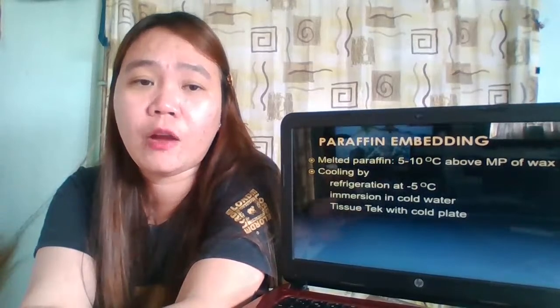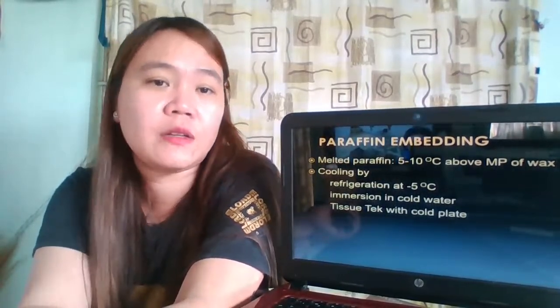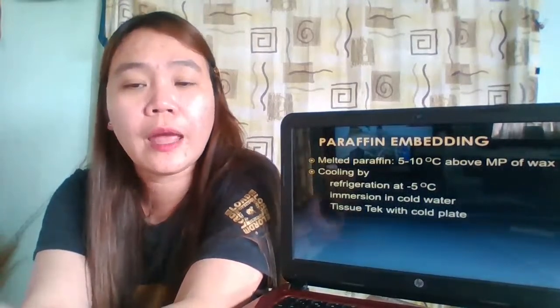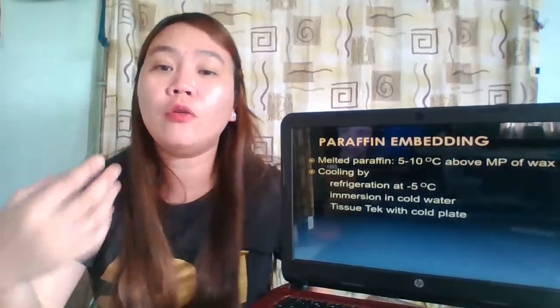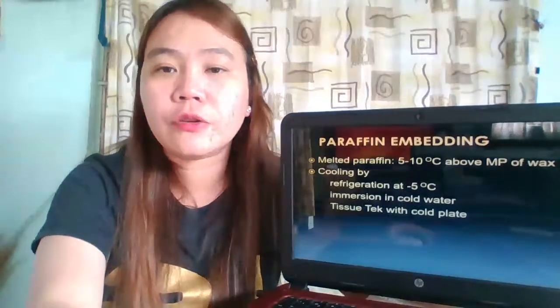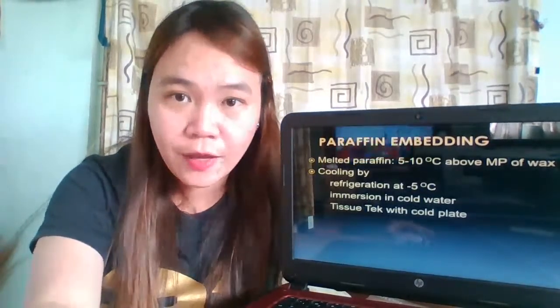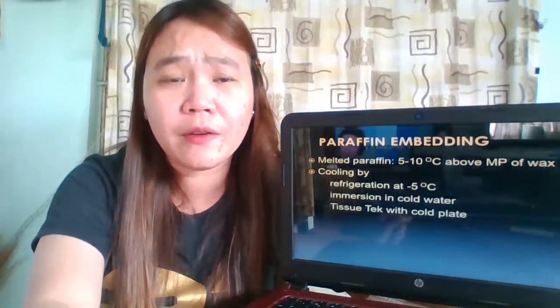Again: refrigeration at -5 degrees Celsius, immersion in cold water, or the Tissue-Tek's cold plate. Those are the things you have to remember for paraffin impregnation and embedding.